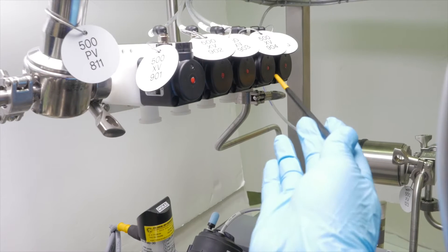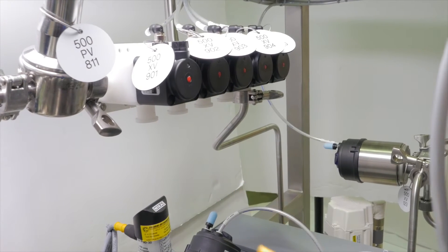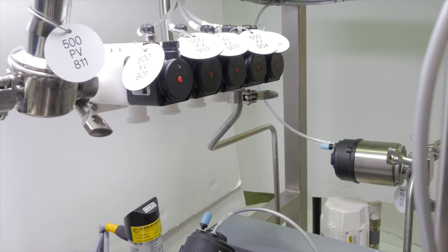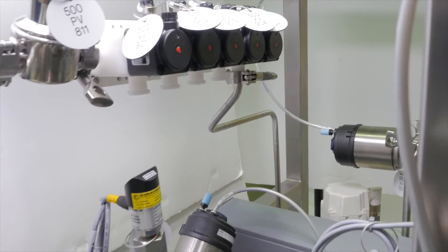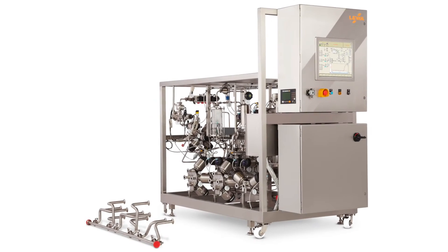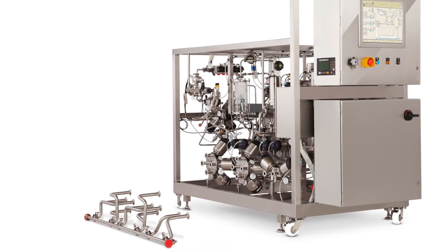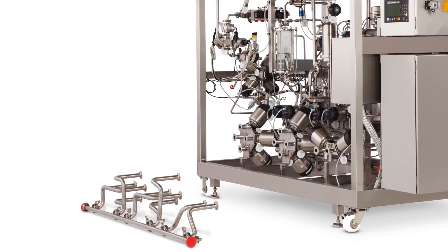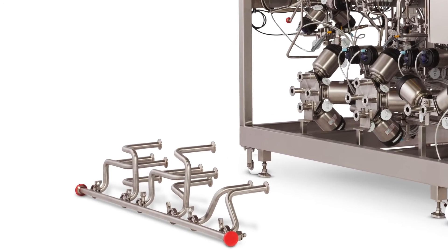The outlet valve block includes four fraction valves and one waste valve. Customers have the option to add either two or six additional valves. An optional CIP manifold that attaches to the inlet and outlet valves can be added to facilitate cleaning the system.